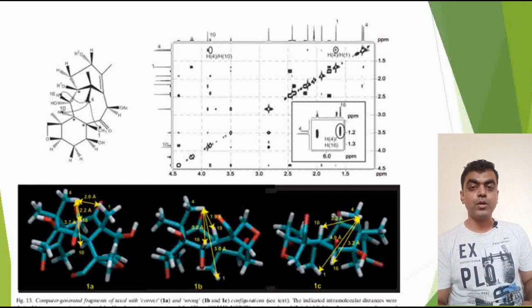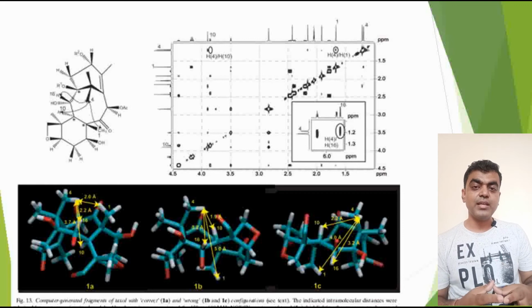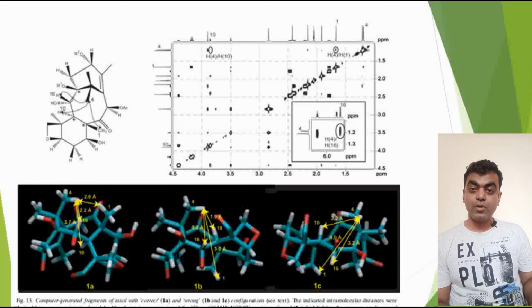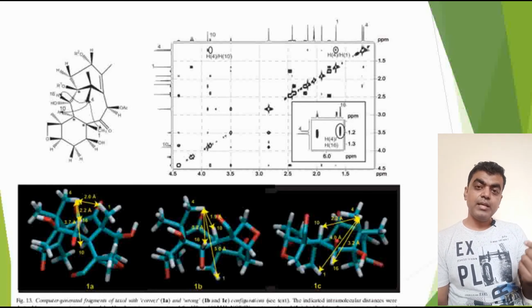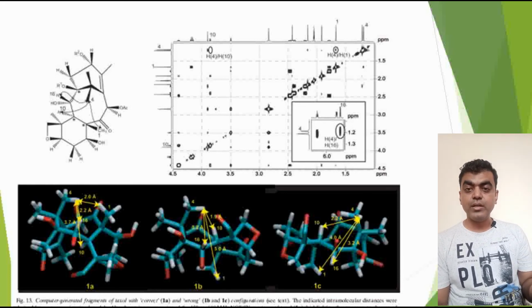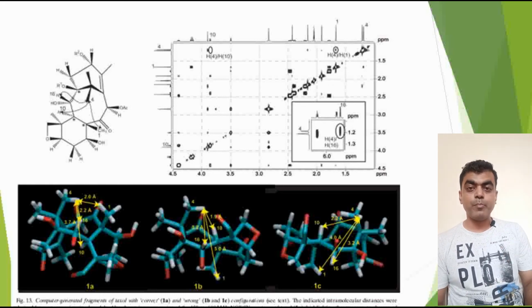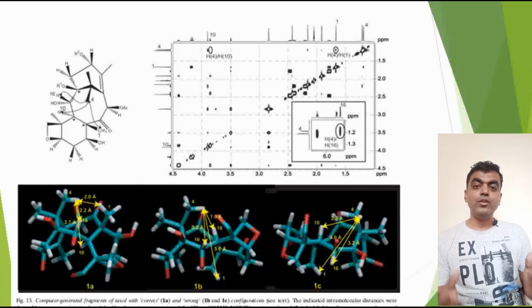So if you follow the protocol, the first thing is, whatever sample you're using, dilute it in an NMR compatible solvent. An NMR compatible solvent can usually be deuterated water, where you do not have separate peaks. You can also use others like CDCl3. There also you do not have a proton, so you can use those, and then use a proper reference. Once you use a proper reference, you align it.